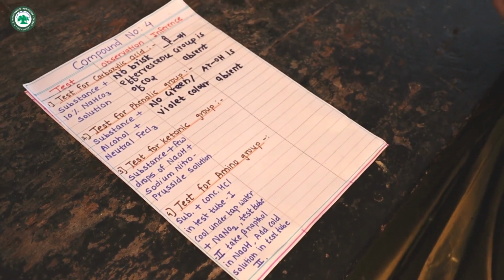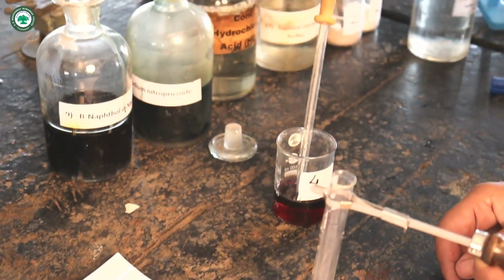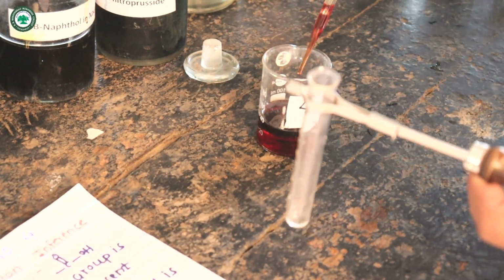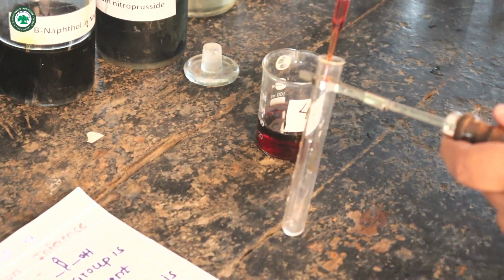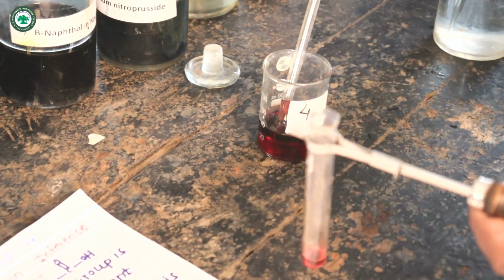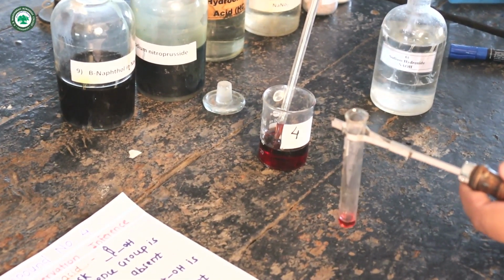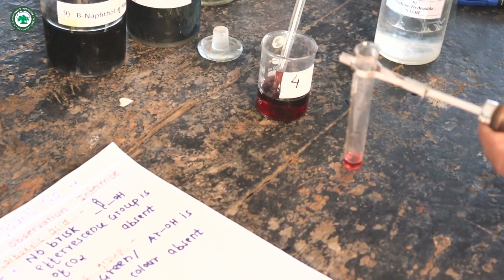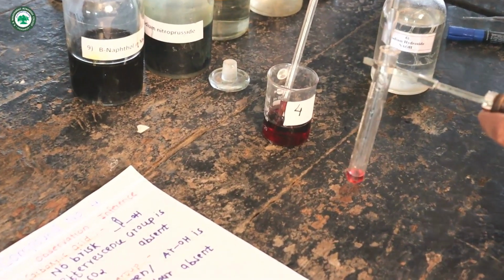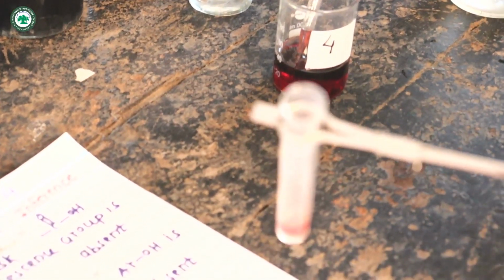Now third test for the same compound. Again take a test tube with test tube holder. Take 1 to 2 drops of compound 4. Add few drops of NaOH. Shake the test tube.